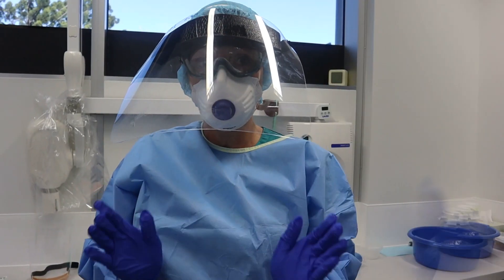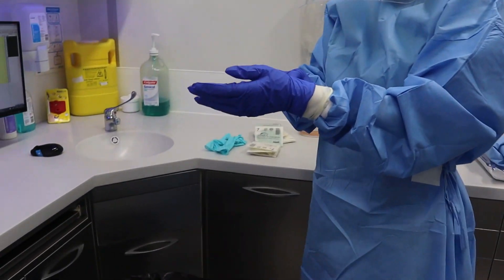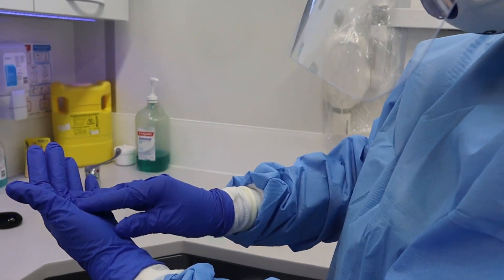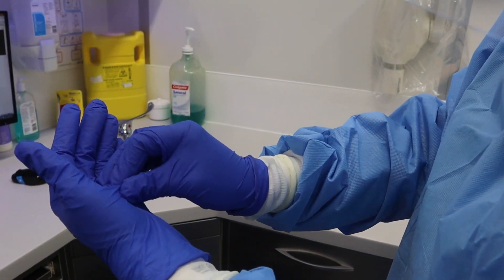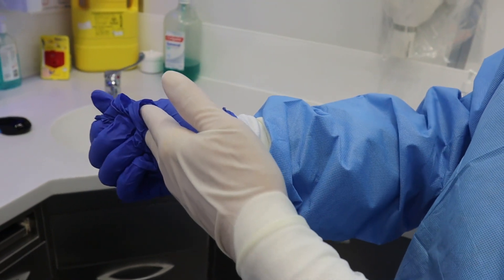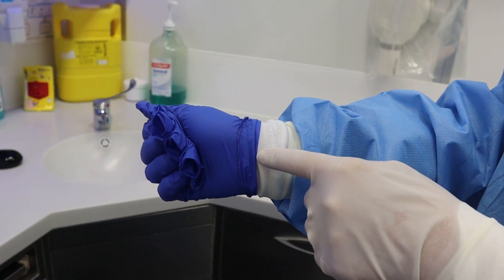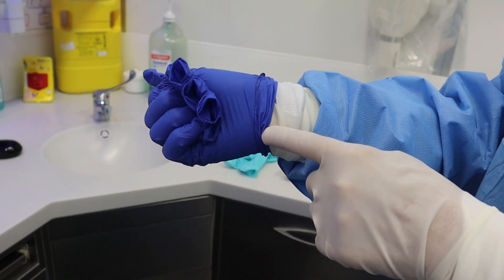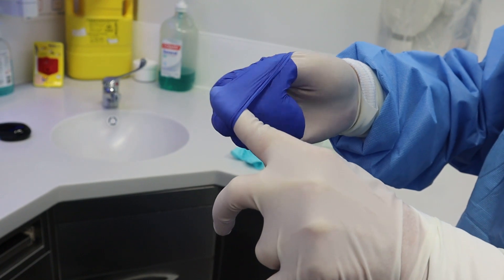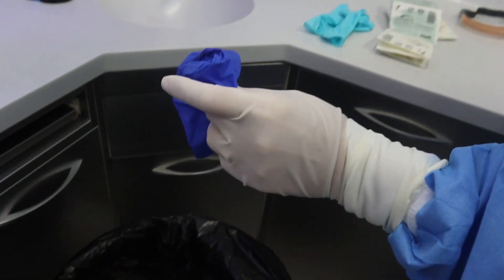Now the surgery is over and it's time to remove all this gear — this is called doffing. First, get rid of the outer gloves without contaminating your arm: grab the middle of the glove and bunch it up, then with the index finger slide it under the top of the second glove and try to encapsulate all of the dirty part. That goes into the bin.